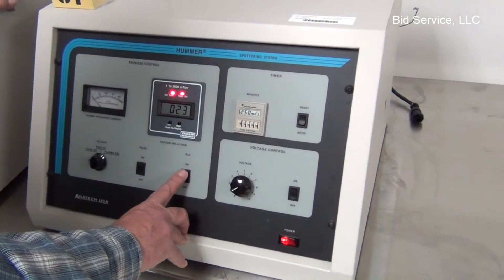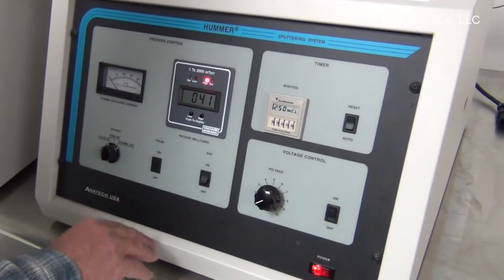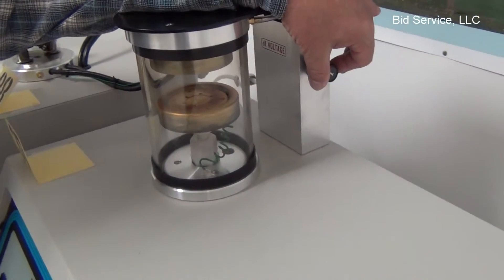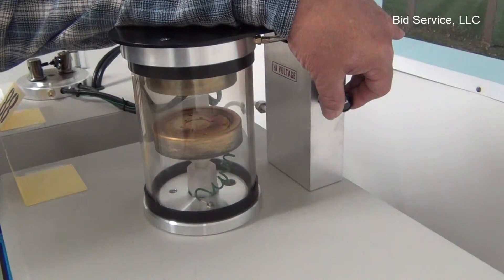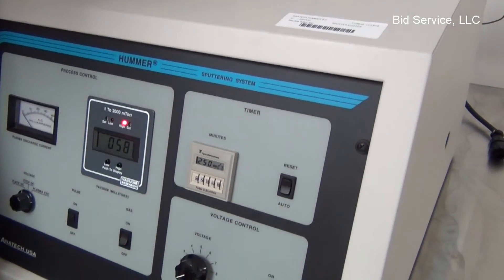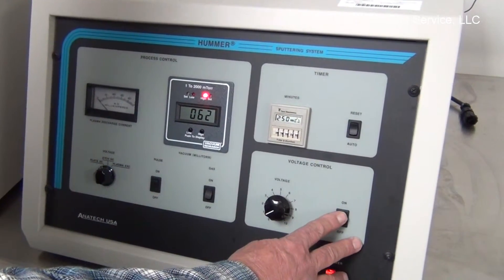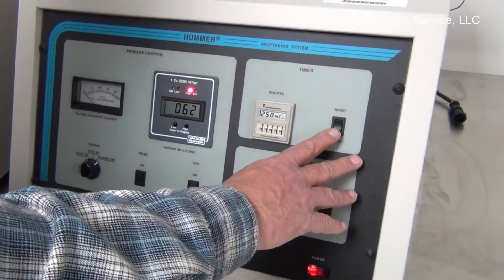We're going to turn the gas on and get to approximately 60 milliTorr for the supplemental gas. The control for the supplemental gas is on the right side here. I'm going to take three steps to get to 60. At this point we're ready to plate, so we'll turn our voltage control on and then hit the auto button, which will start the countdown timer.